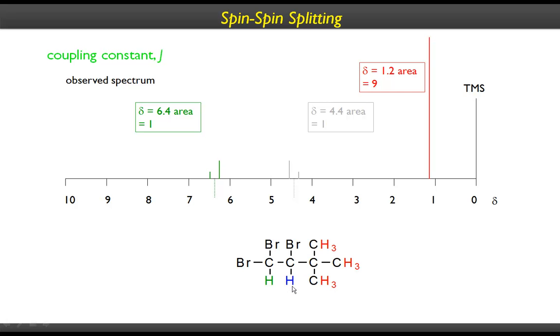However, this is because of local magnetic field differences. Local magnets, there are tiny magnets. Each spinning nucleus is a magnet. So this is a magnet and this is a magnet, and now we have an external magnetic field, and the external magnetic field is what is causing the different spin states for these spinning nuclei.